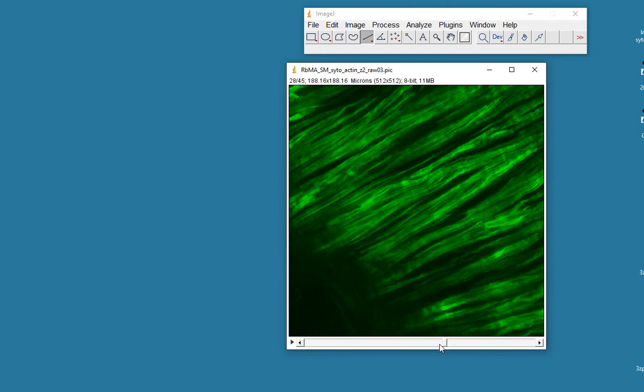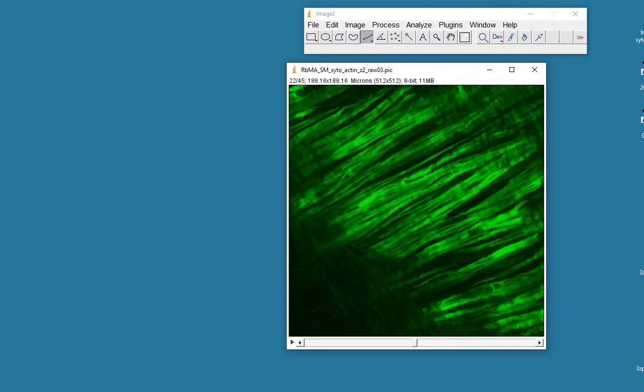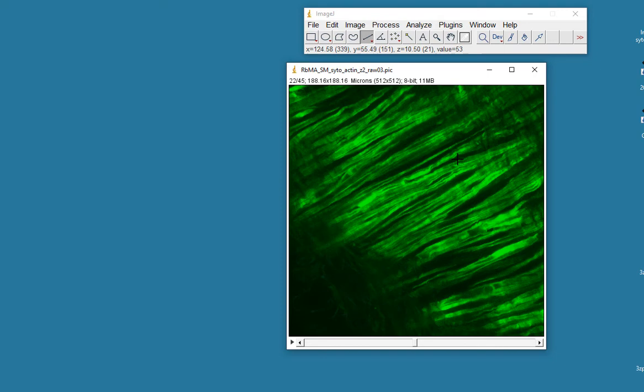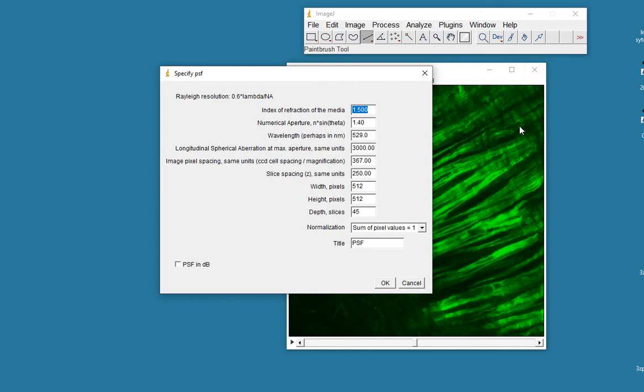Now I think we can probably get a clearer picture of these individual actin filaments by going through a digital deconvolution process, and that's what I want to demonstrate. You'll need two plugins for this. One is a diffraction PSF, and the other one is a parallel spectral deconvolution. So the first thing we need to do is to create a point spread function. So I'll go to my 3D analysis and look for my plugin which is a diffraction point spread function 3D.